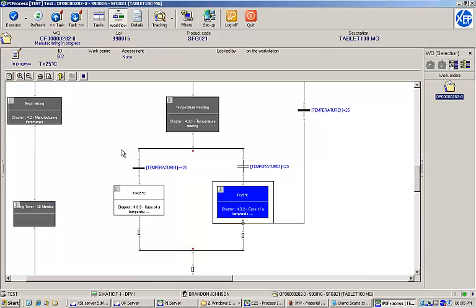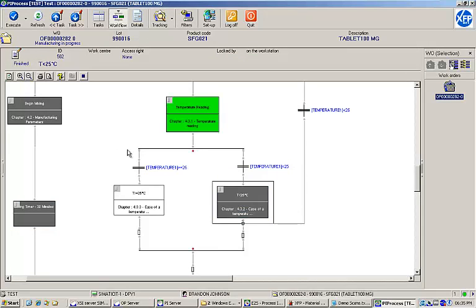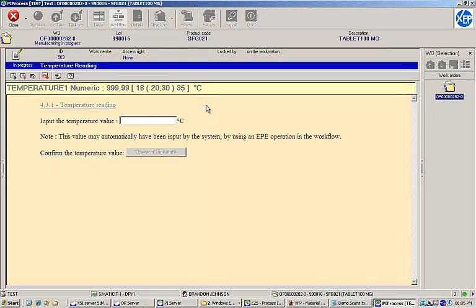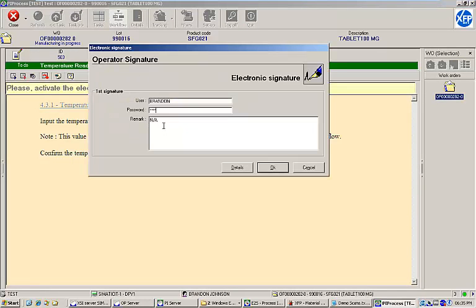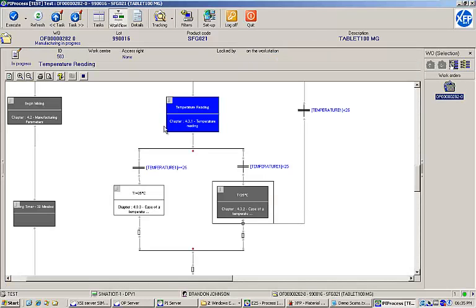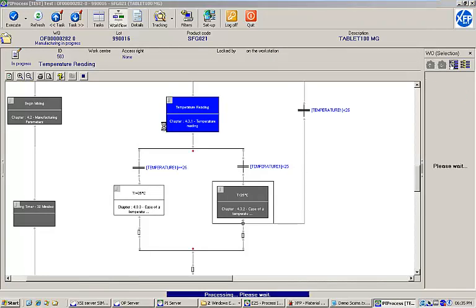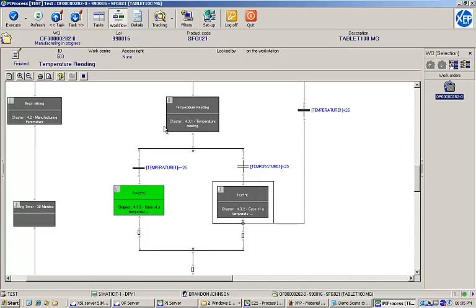Now that I've heated my solution, the workflow will loop to the previous task and allow me to record a new temperature. This time, let's record a temperature of 28 degrees. Because the value is within range, the workflow automatically activates the task in the left-hand path.